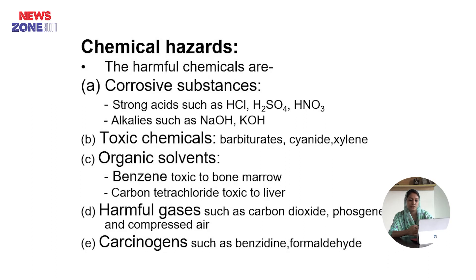Harmful chemicals include corrosive substances such as strong acids — hydrochloric acid, sulfuric acid, nitric acid — and alkalis such as sodium hydroxide and potassium hydroxide. Toxic chemicals include barbiturates, cyanide, etc. Organic solvents: benzene, toxic to the bone marrow; carbon tetrachloride, toxic to the liver. Harmful gases such as carbon dioxide and compressed air. Carcinogens such as benzidine and formaldehyde.